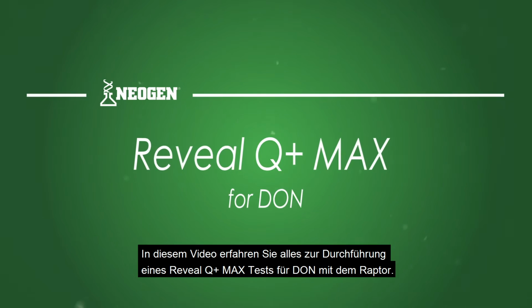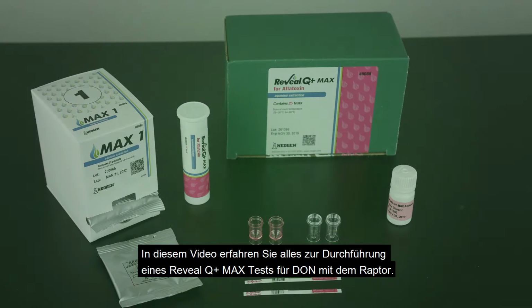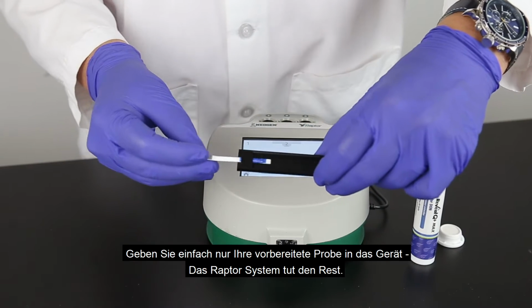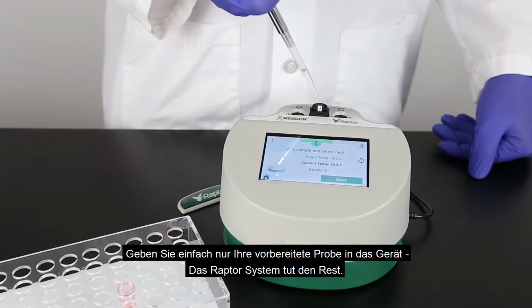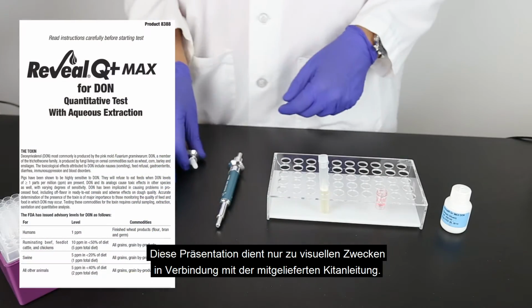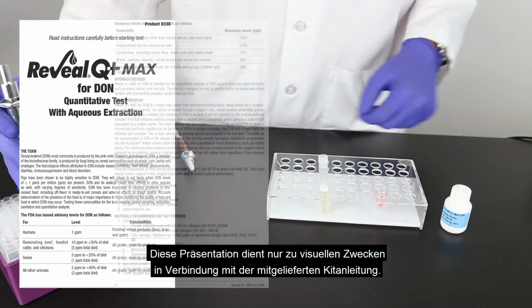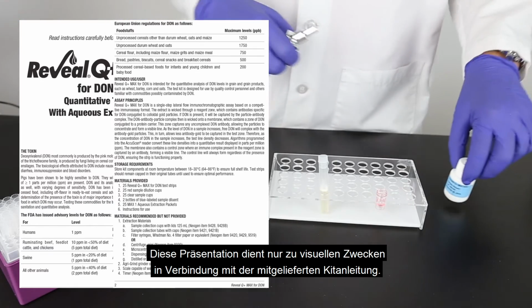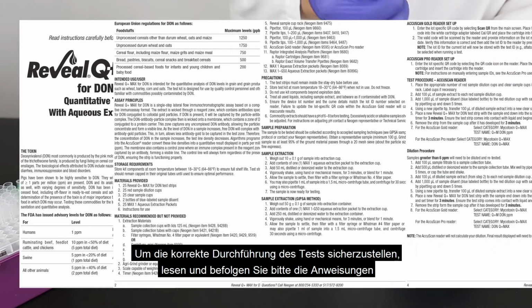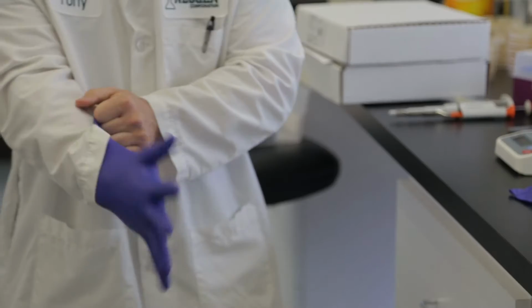In this video, we'll look at everything you need to know to run Reveal Q+ Max for DON using the Raptor system. The Raptor system allows you to add sample and walk away. It's that simple. This presentation serves only as a visual guide to the written materials supplied with the test kit. To ensure accuracy in the performance of this test, please read and follow the test's written instructions in their entirety.